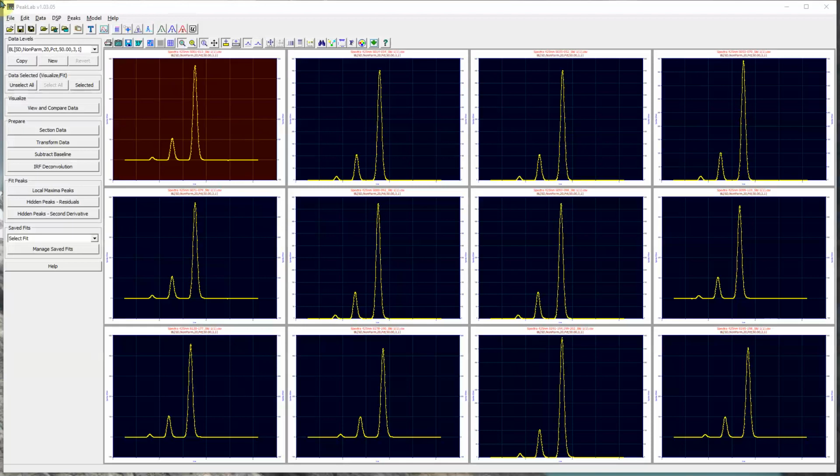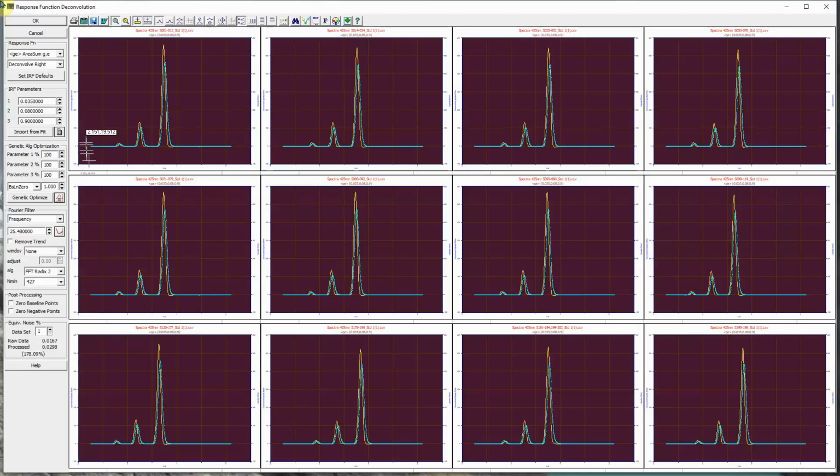So long as there are no changes in the instrument, the injector, flow path, column, detector, in the mobile phase, in the run conditions, flow rate, temperature, or in the prep, these 3 IRF parameters are unlikely to change in any future similar separation. We will first enter these values in the IRF deconvolution procedure.